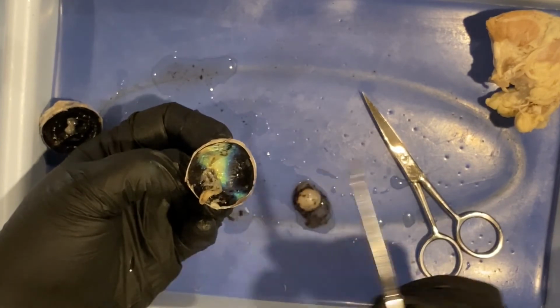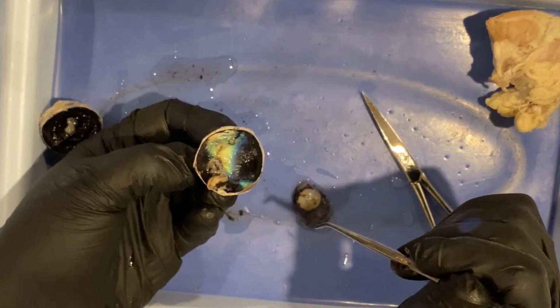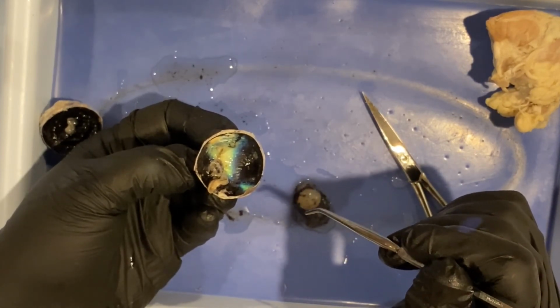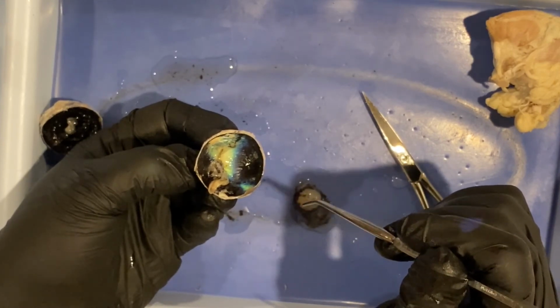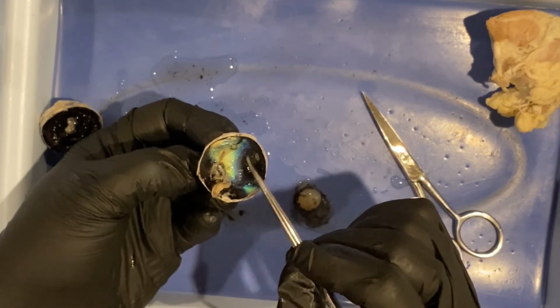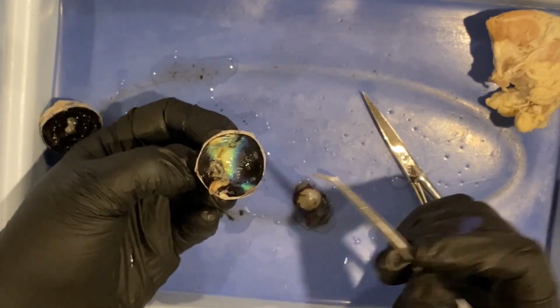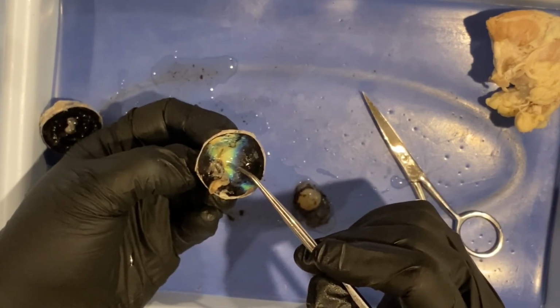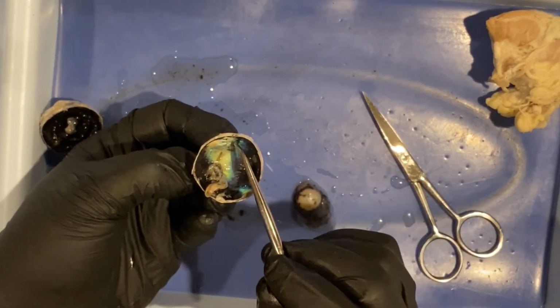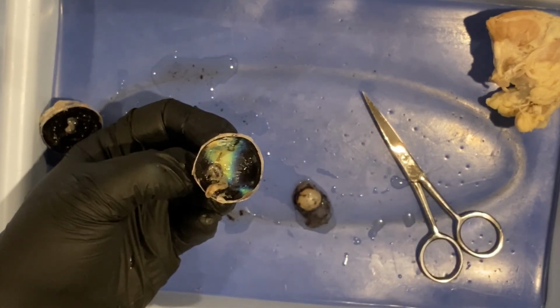Now, animals that are nocturnal will have this shiny portion to it. If you've ever pulled into a driveway before and your headlights are on and you see a cat or you see a deer, you have this glowing that's coming back at you, and it's this particular portion of that tunic. This is called the tapetum lucidum. Think tapestry of light. It always reminds me of kind of like an abalone shell, but this is reflecting light back into the eye to try to help with animals that are more active at night.